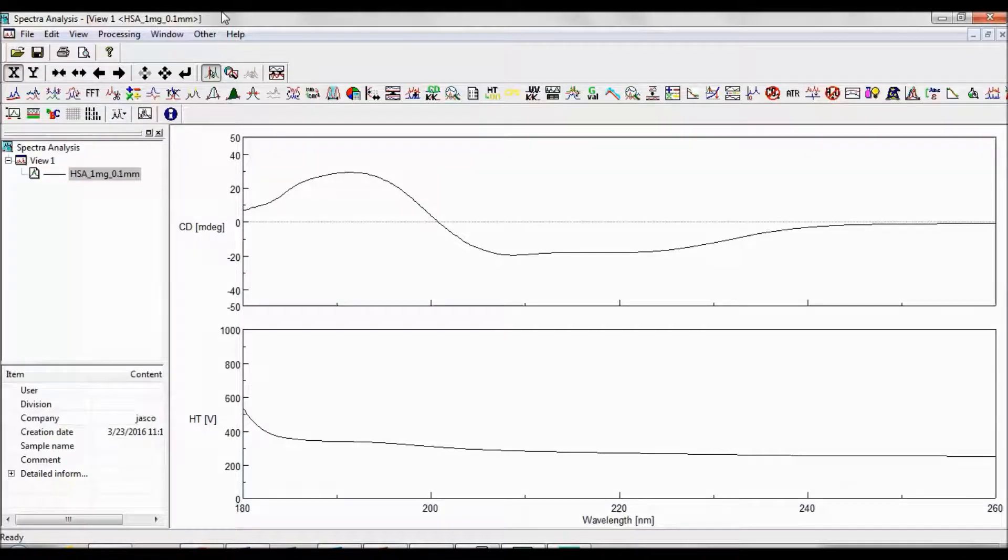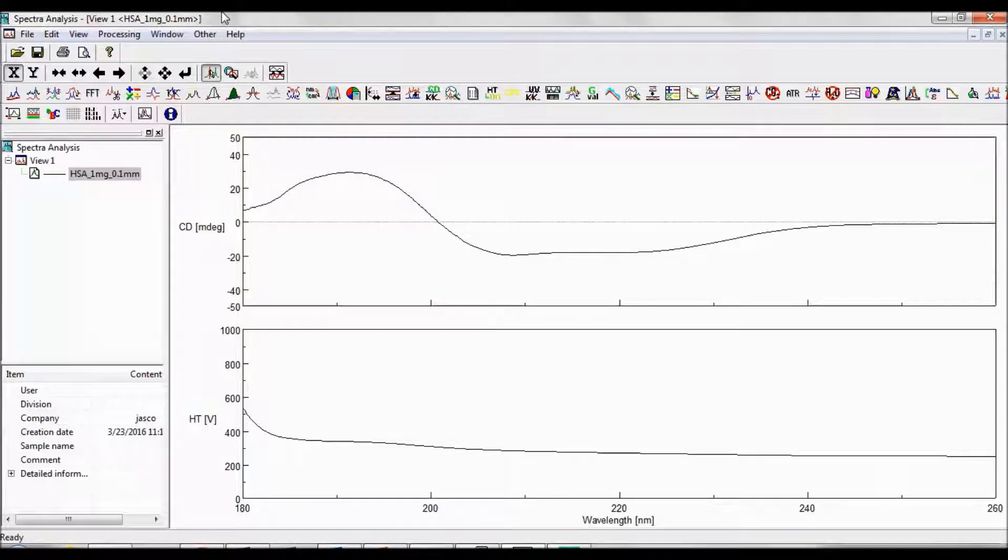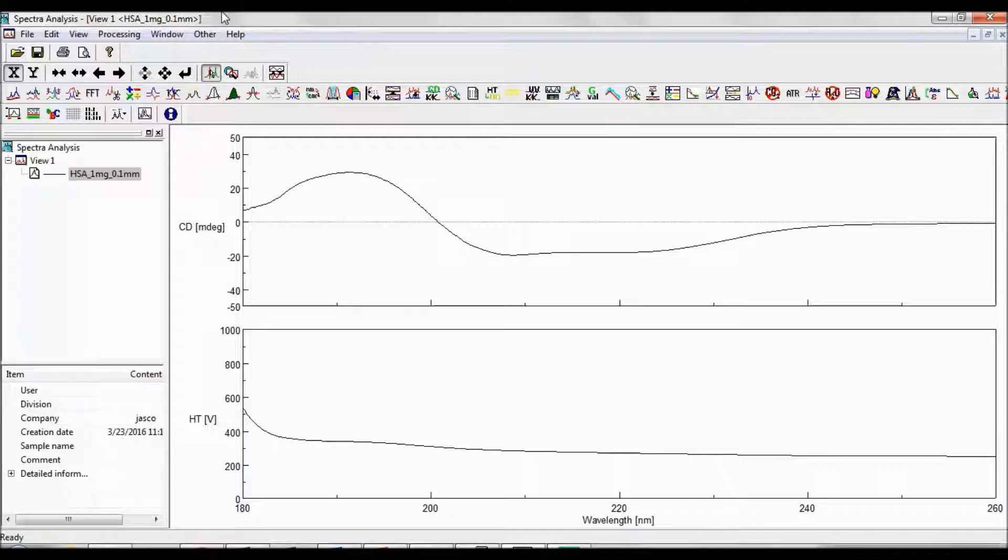Spectra analysis allows you to convert your CD data, which is measured in units of ellipticity, to units of molar ellipticity. This will be of use if you choose to analyze the secondary structure content of your sample spectrum.